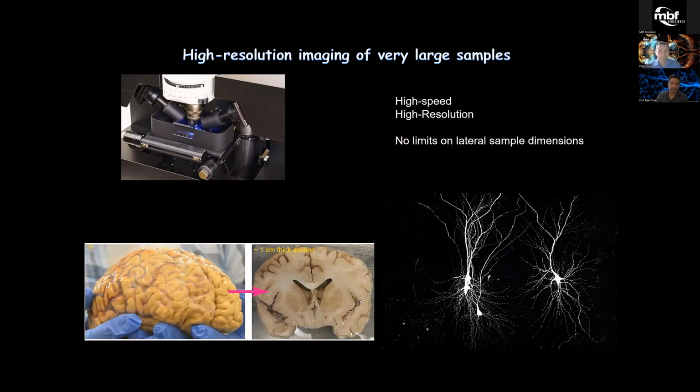So at the software level, we can do this linearly adaptive scanning, which can image samples from clarity all the way to iDisco with different refractive indexes, making sure we get the best quality throughout. So that sort of paints the picture that we can image that kind of large sample, like a centimeter thick slab of human brain with that kind of resolution.